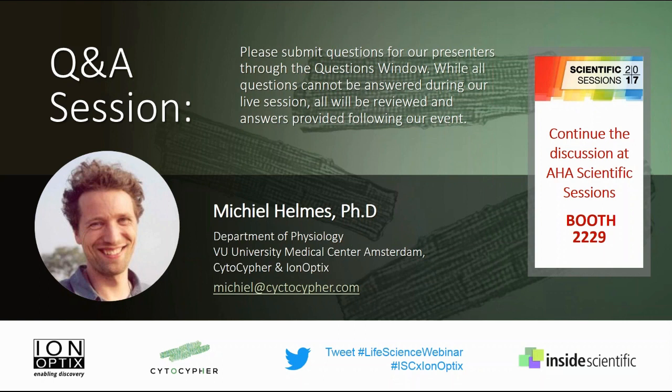Perfect. And maybe our last question here. This comes from Alexia. Can we measure contractility on each of the cells for more than 5 seconds? Yes, of course, you just adjust the protocol. I picked the 5 seconds for a reason, because we paced them at 2 hertz, and I think 10 contractions gives you a good image of the cell. But I know that people who are already using the system use, for example, 20 seconds, because that gives them the best chance of catching a rhythmic event.